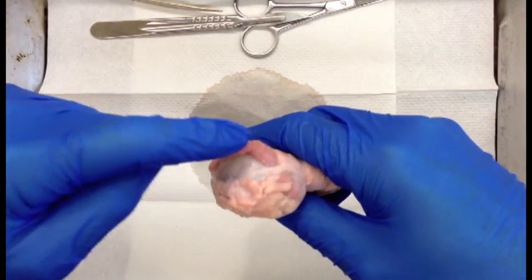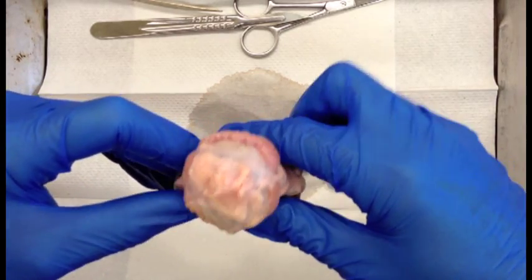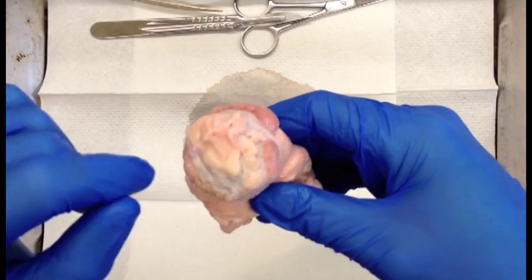These are the extrinsic eye muscles, and what these do is allow the eye to move around. You think about when you move your eyes to the left, you look to the right, you're using these extrinsic eye muscles to do that.